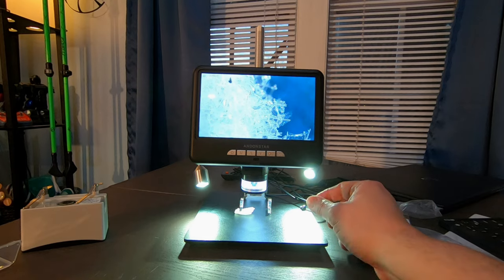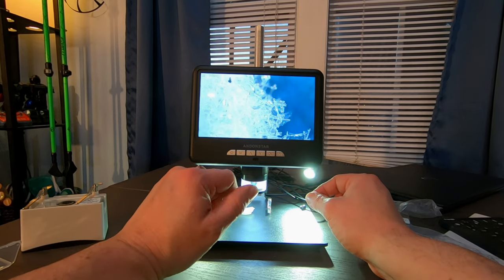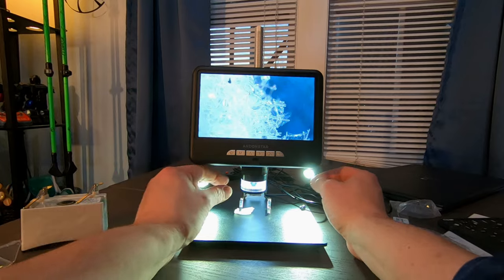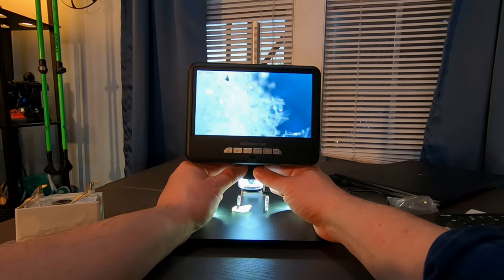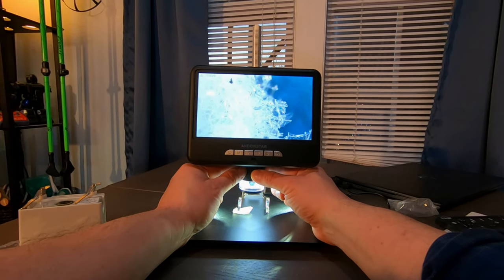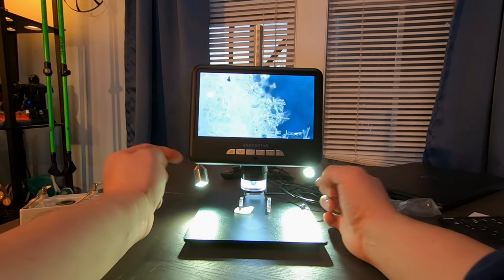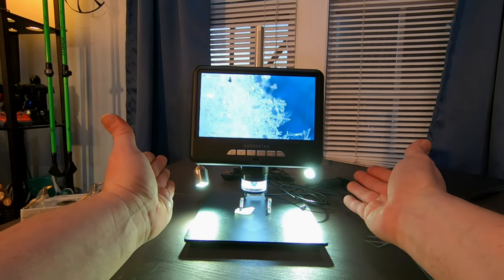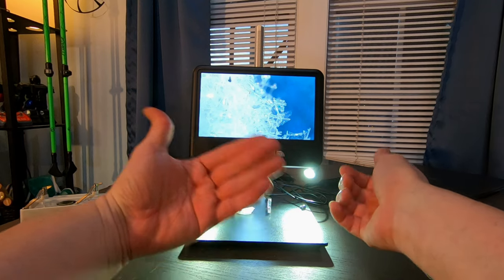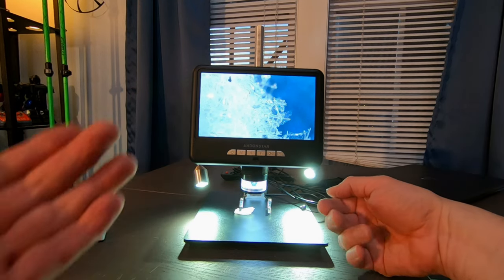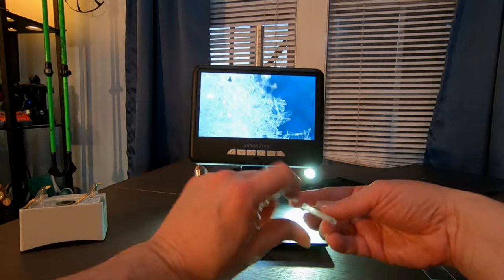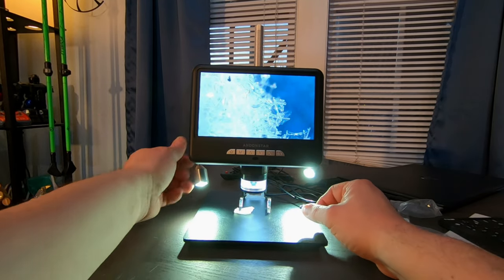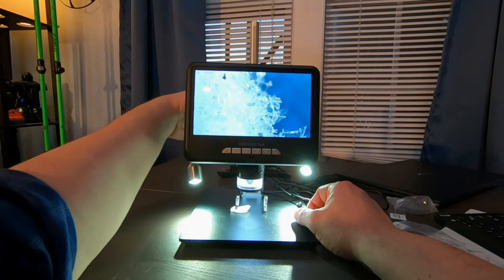So this is the Addon Star Digital Microscope. The AD207S Pro. This is really going to help out. This is also great for teachers. If you're a homeschool parent. And you're trying to teach your kids about the world of the small. And have them. You can just have a blast. You know. You don't have to go looking at a microscope. That's a mono microscope with one eye. You can now just use a monitor. So this really is going to make things a lot easier. For everything. And for everyone. And if you are working on microscopic work. You need to do something.